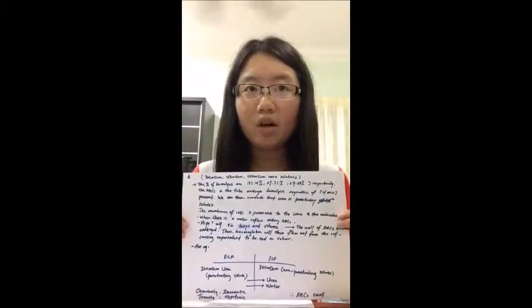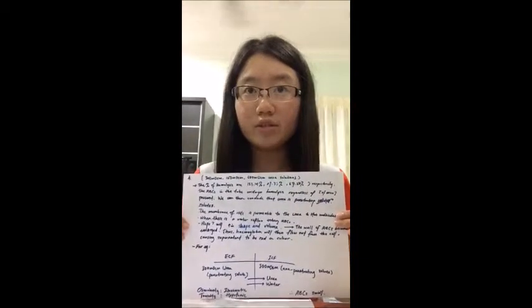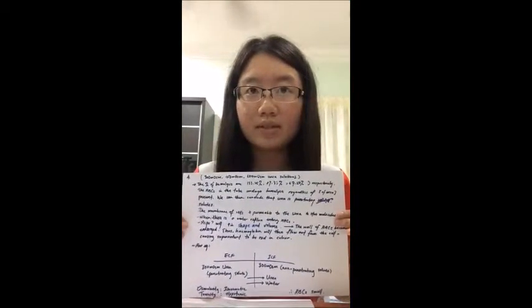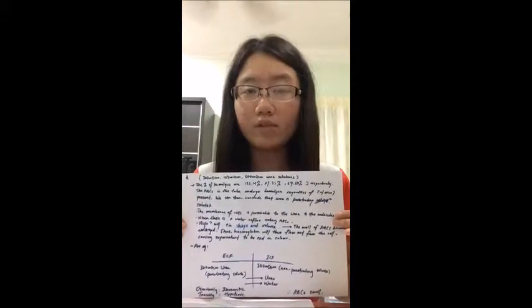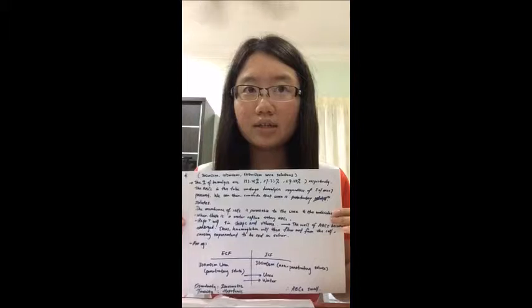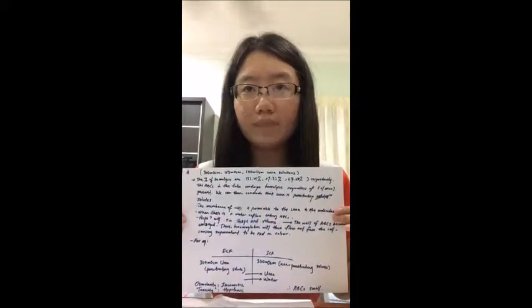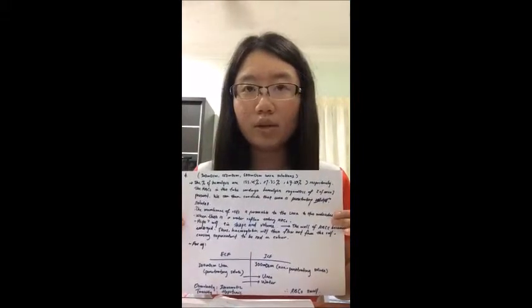For the 300 milliosmol, 150 milliosmol, and 600 milliosmol of urea solutions, the percentages of hemolysis are 133.21%, 87.33%, and 67.50% respectively. The red blood cells in these tubes undergo hemolysis regardless of the concentration of urea present. We can then conclude that urea is a penetrating solute, and the membrane of the cells is permeable to urea and water molecules.